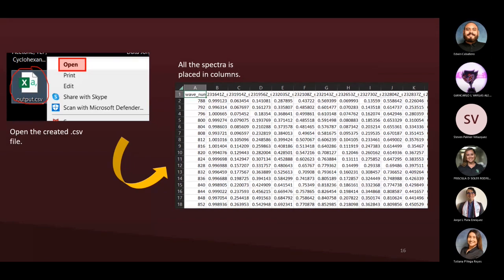The script is going to place all of the samples on a column. The samples are going to have the name of the file that was created for that specific spectrum. And it's a bit tedious, specific for the file that we're working with, because it gives you a couple of numbers at the beginning, which change with each sample. And those specific numbers are referenced to the time, specifically the hours, minutes, and seconds. If they all vary, you cannot basically remove it unless you do it manually, right?